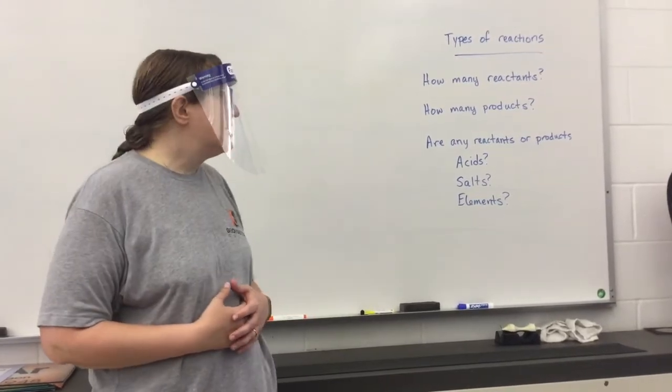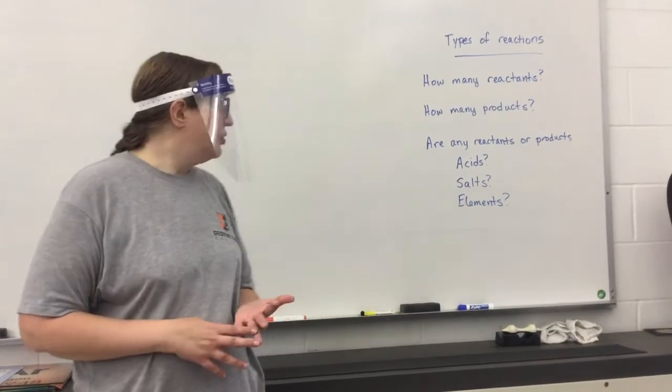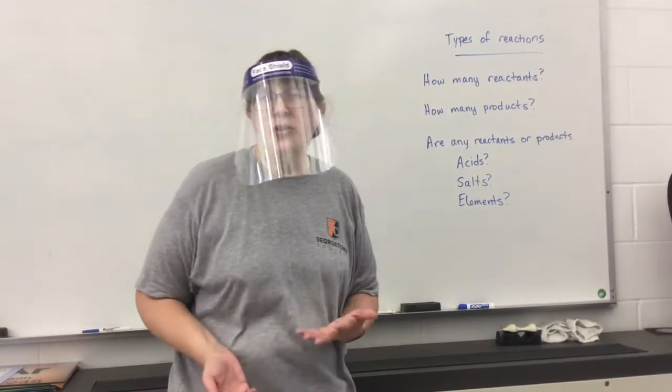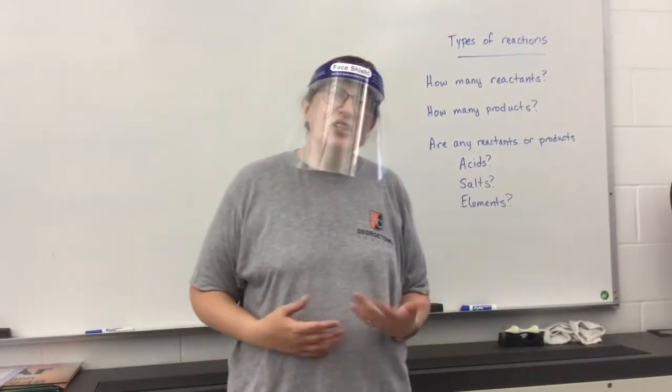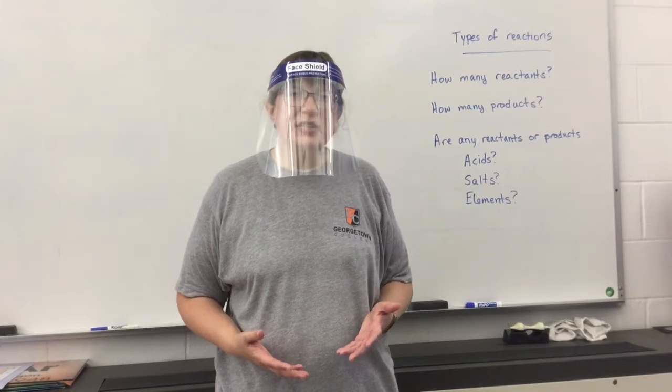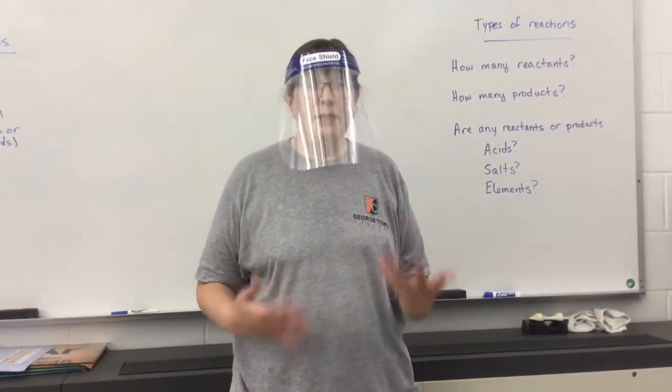You also want to pay attention to, are any of the reactants or products acids or salts or elements, because that will also help you decide which type of reaction is going on. Your procedures ask you to make several observations, and so you're going to want to make sure that you make observations that are relevant in the chemical sense.